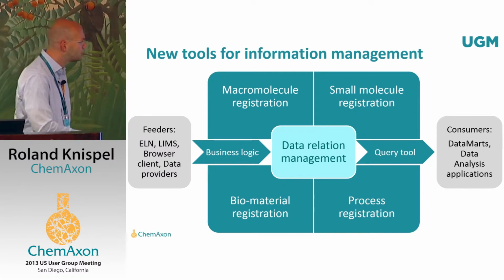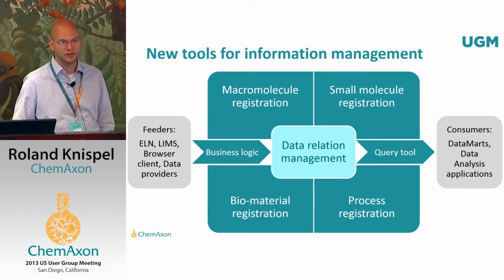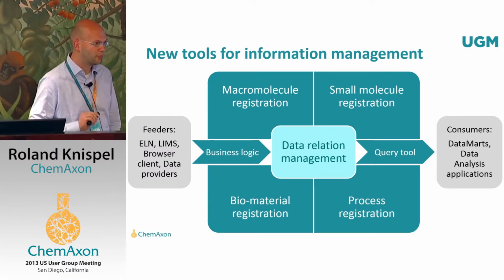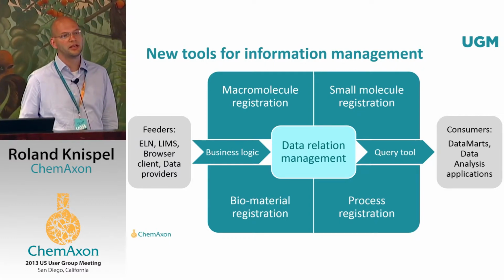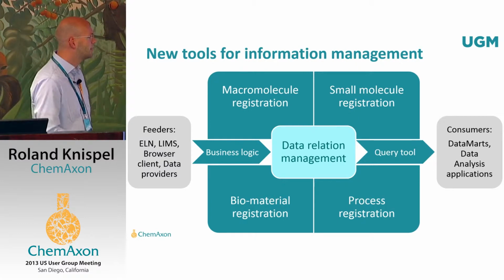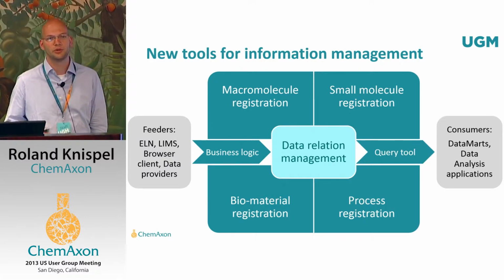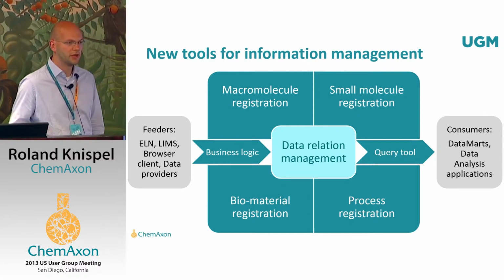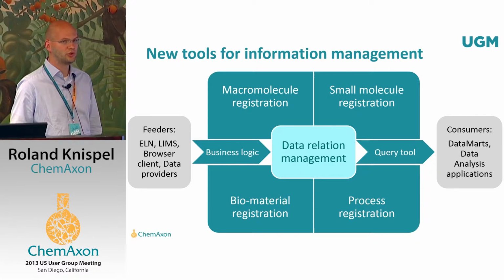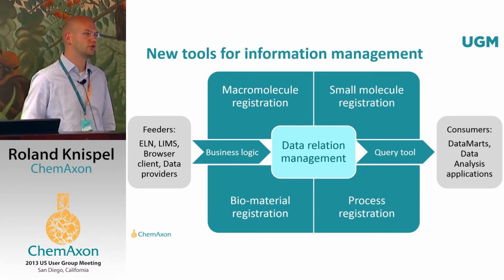And then further downstream, you'd look at an ability to query your data in order to push out the information registered in given IDs and link corresponding data to those individual entities, and then create data marts on which you can do your SAR analysis, your data analysis, and have further downstream applications which consume the data based on individual IDs given in these registration systems.